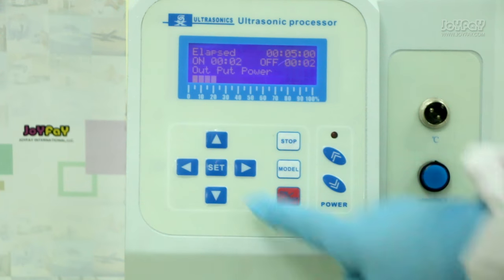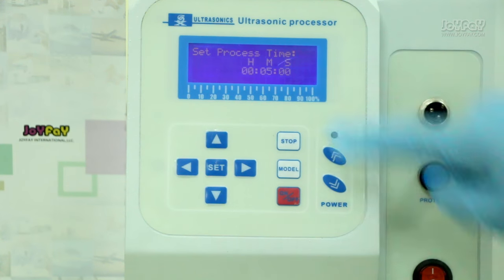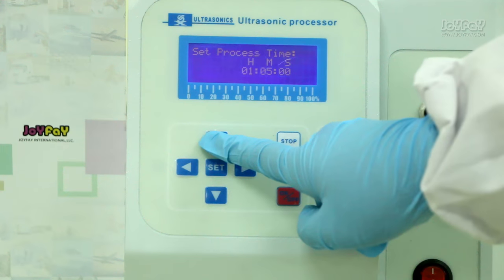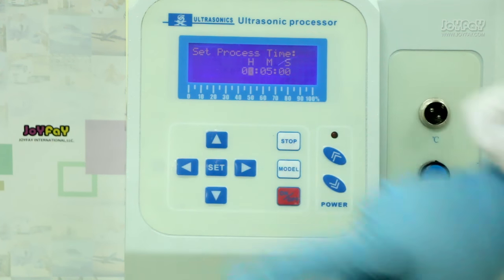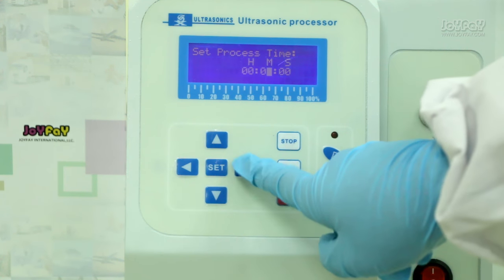The left part is the work time setting section. When you press the setting button, the screen shows processing time in hours, minutes, or seconds. You can press the up or down button to increase or decrease the work time, and press the left and right buttons to move between time settings.